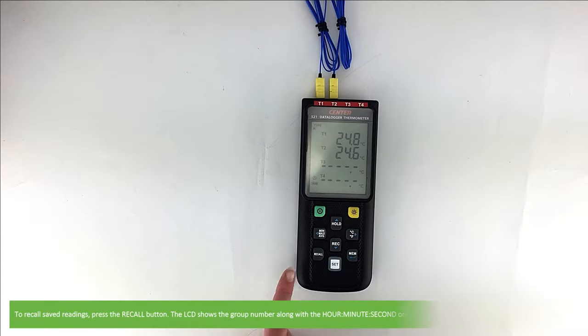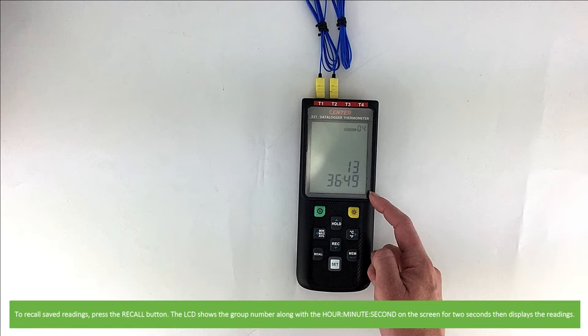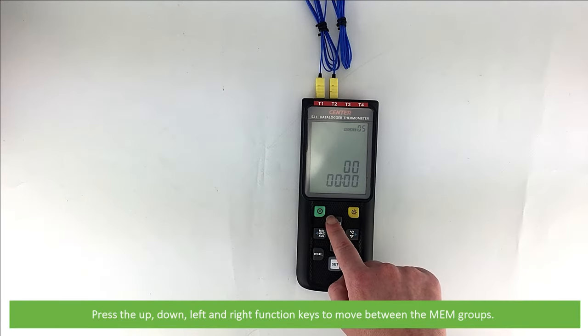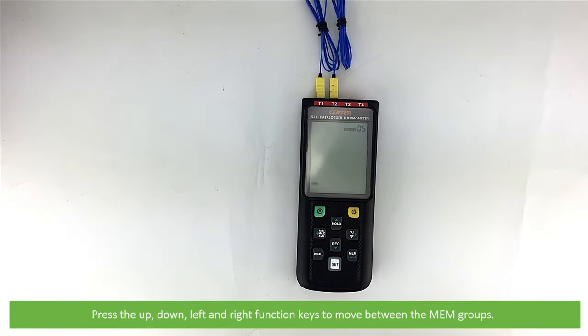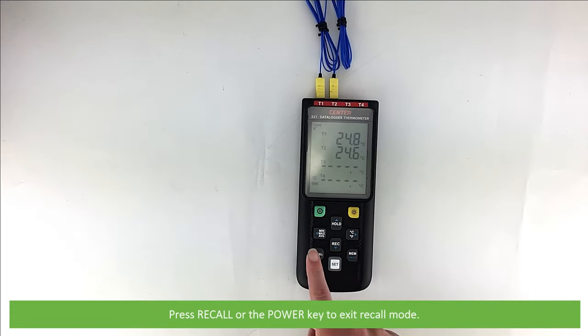To recall saved readings, press the recall button. The LCD shows the group number along with the hour, minute, and second on the screen for two seconds, then will display the readings. Press the up, down, left, right function keys to move between the memory groups. Press recall or the power button to exit recall mode.